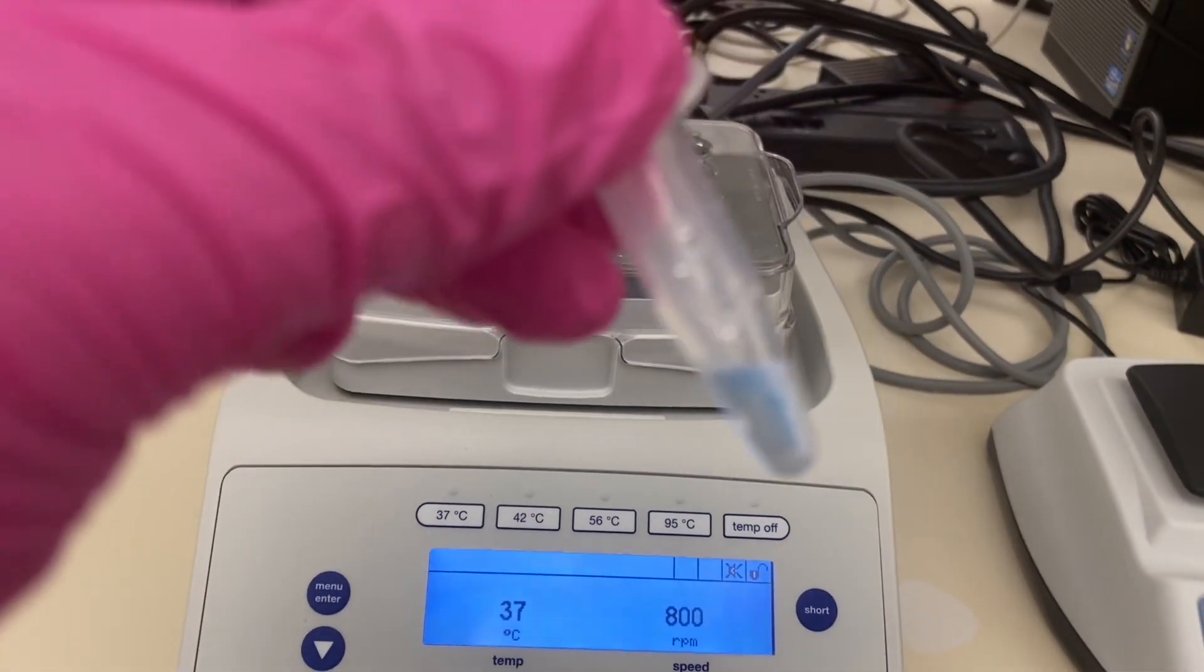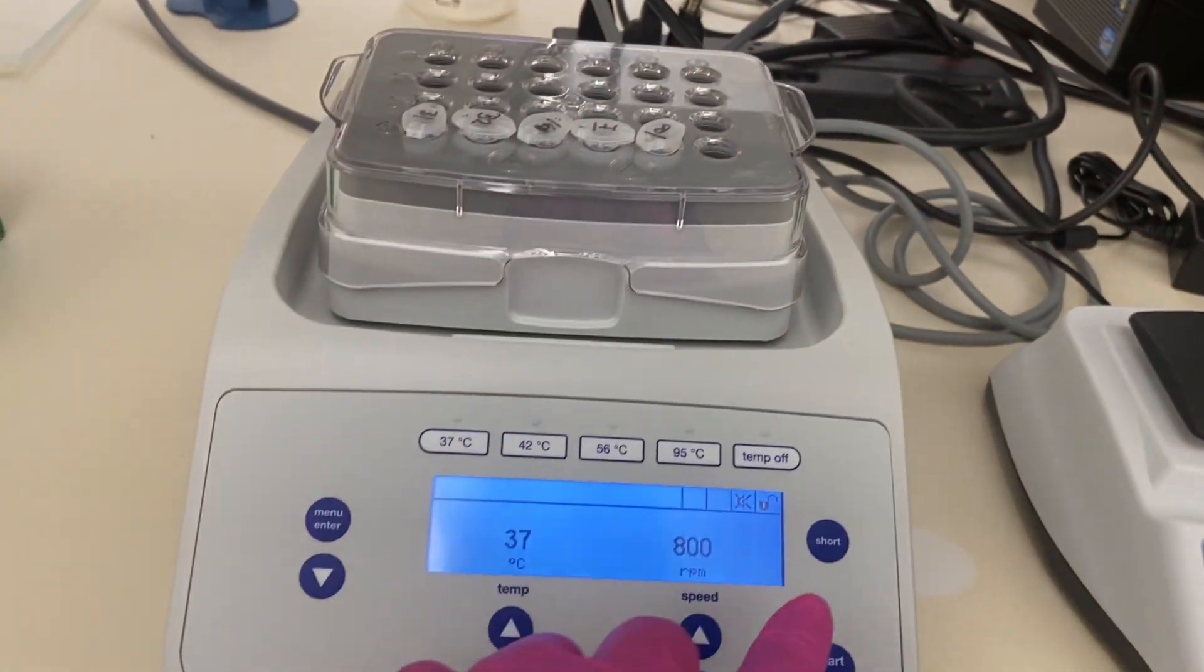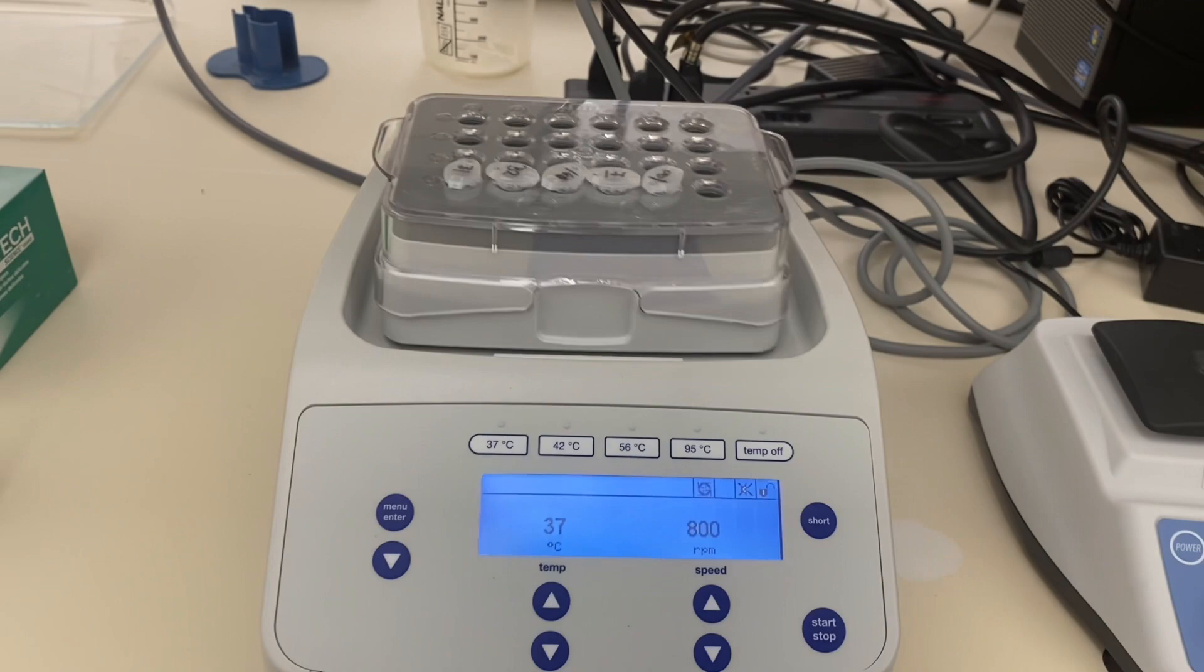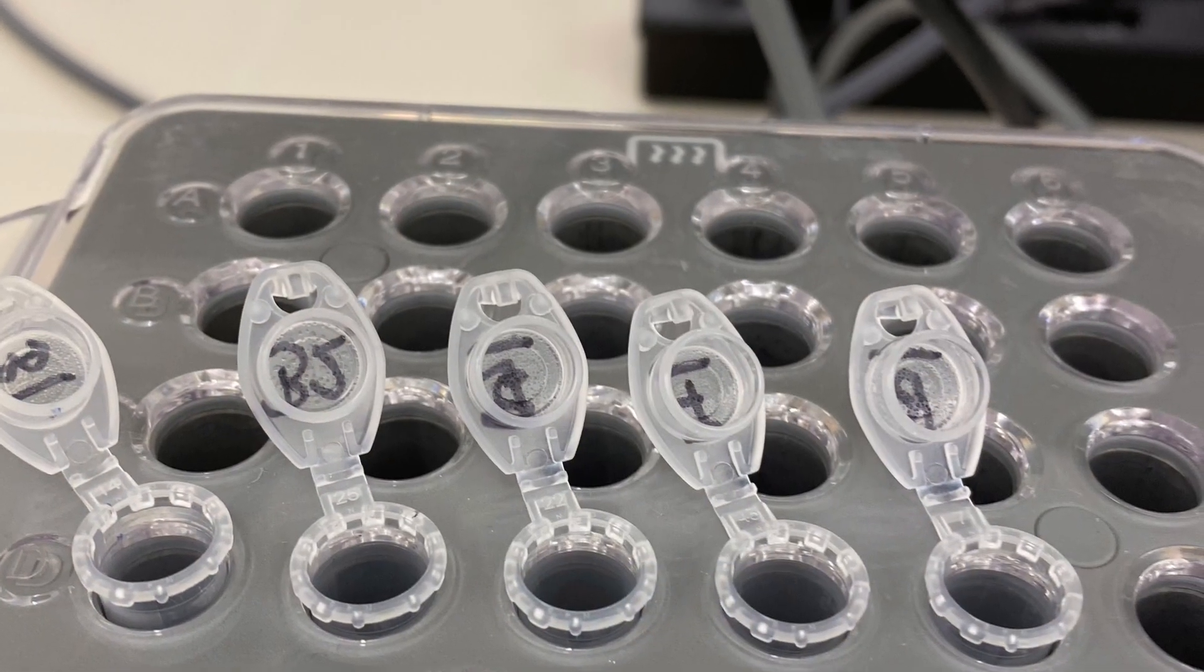Our next step is reduction and I'm going to be using 20 mM TCEP in ambic. Ambic is short from ammonium bicarbonate. The process takes 30 minutes on 56 degrees celsius.